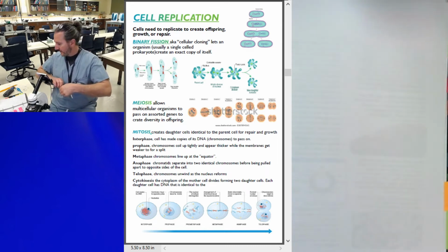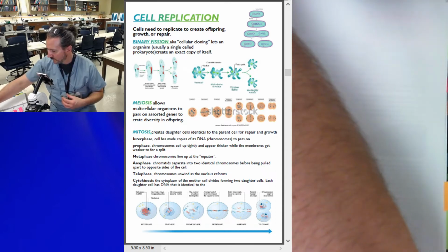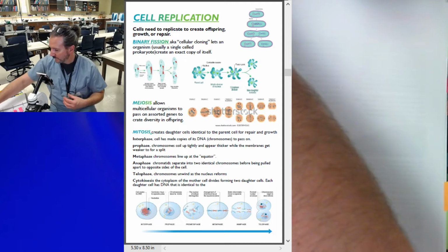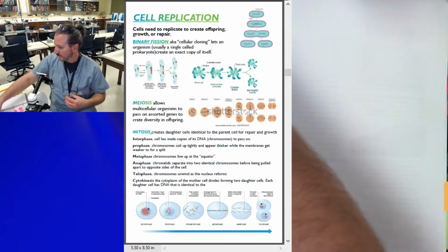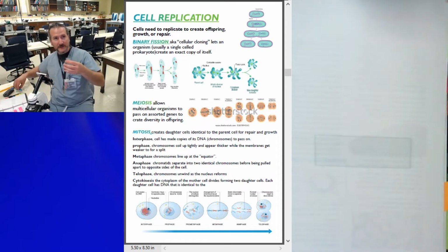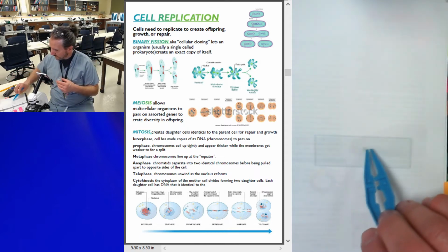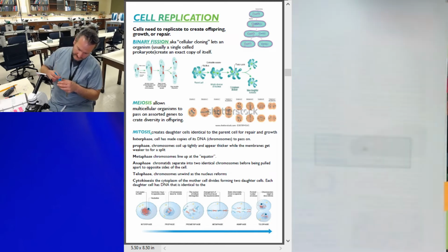So I'm going to take a slide from earlier. Here. I'm going to take my tweezers. Here's my little bag of onions. Really smells oniony too. I'm just going to push them against the wall of the bag and drag up a couple little pieces of onion. Little tiny slivers.